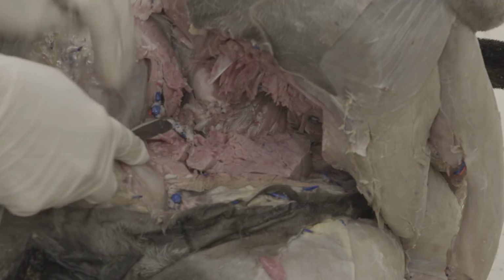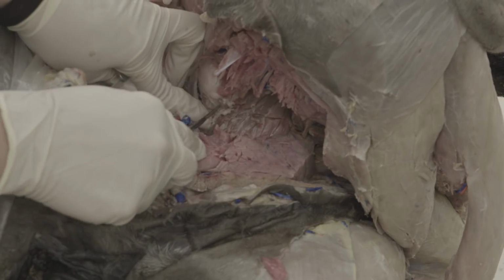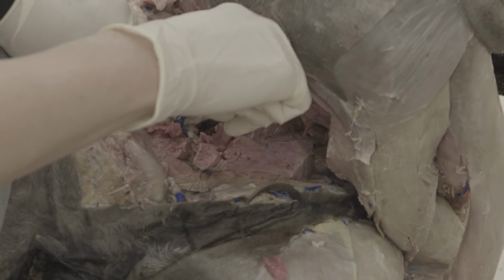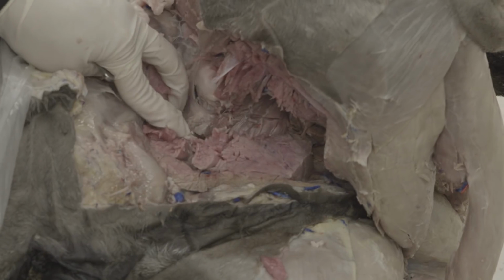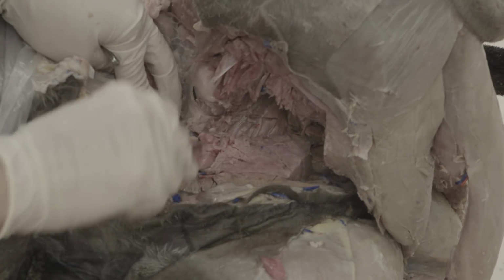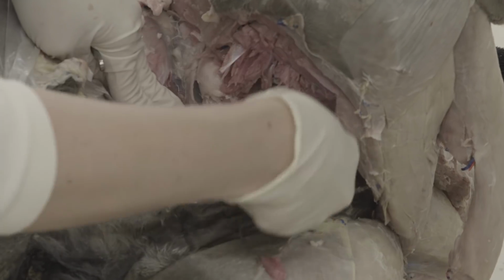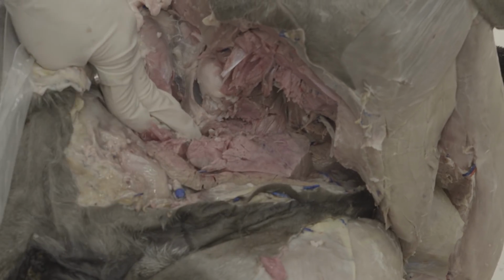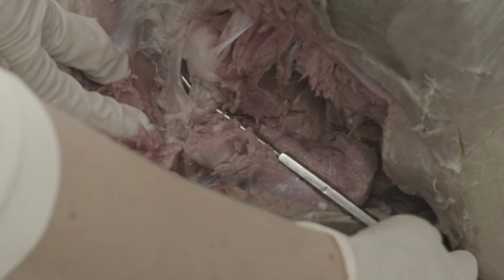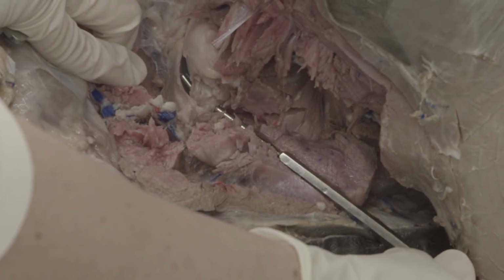So you will cut through that and then try and rotate the limb out a little bit more and see. So here you can see the lip of the acetabulum, and inside it is the ligament of the head of the femur, which is different than the accessory ligament. But I don't know if we're actually going to be able to see that very well. Let me try and cut through this a little. Okay, so I cut it a little bit to get some rotation. But hopefully, if I put the probe under it, you can see that the ligament of the head of the femur is right there. So attaching to this, which is the head of the femur, and the probe is underneath that ligament of the femoral head.